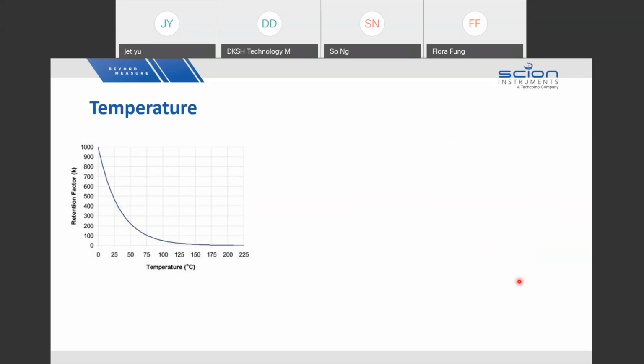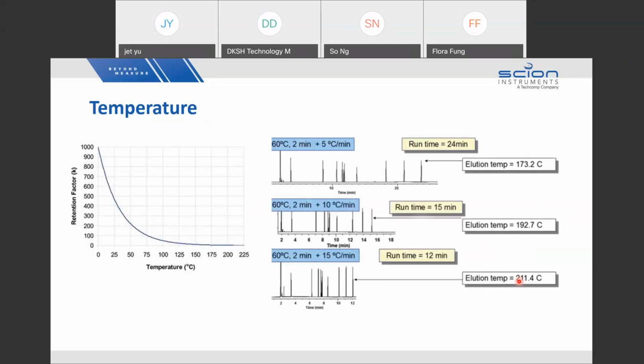All right, when you start a GC analysis, this is about the temperature gradient. So usually the initial temperature is low, and before the end of the oven temperature programs, the temperature gets higher and higher. Okay, so it will generate great impact on those late eluters. Okay, late eluters tend to stay in the column, not willing to come out very fast, but if you increase the temperature, then it can help them elute faster. Okay, then reduce the total analysis times.